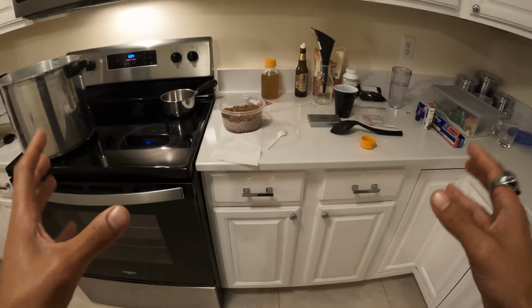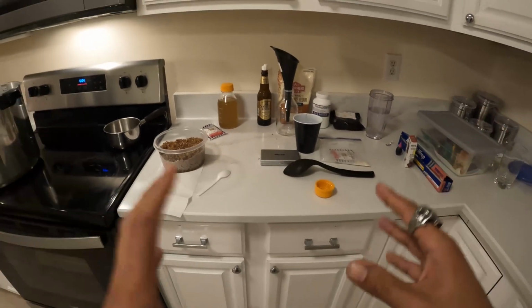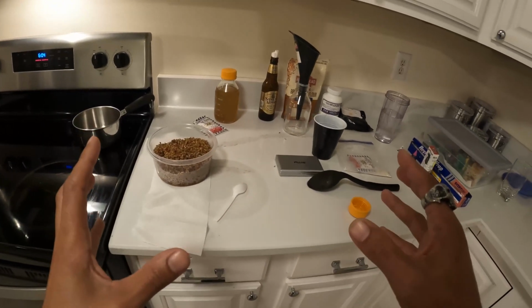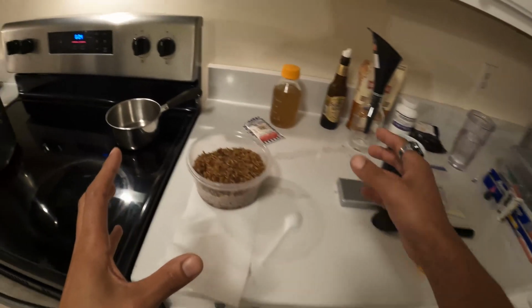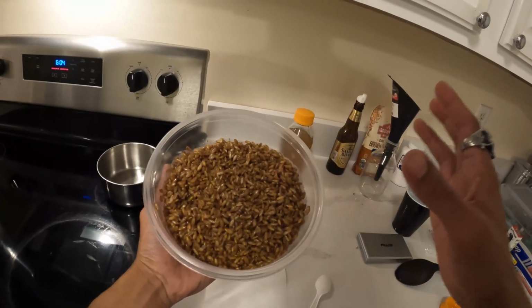Let's make agar at home. I'm gonna make two different recipes here, and I'm gonna show you two different ways how to do them both. So first, let's start with grain water. Grain water is one of my favorite recipes.